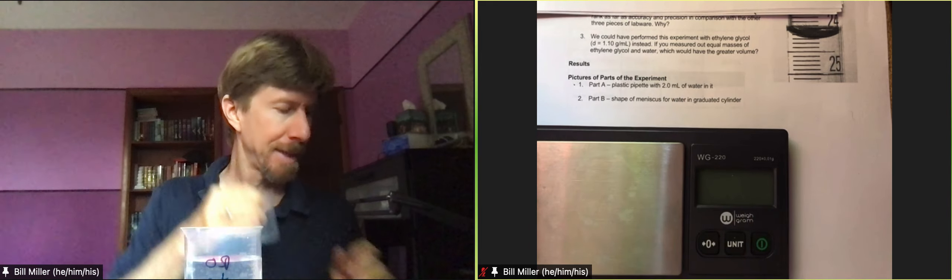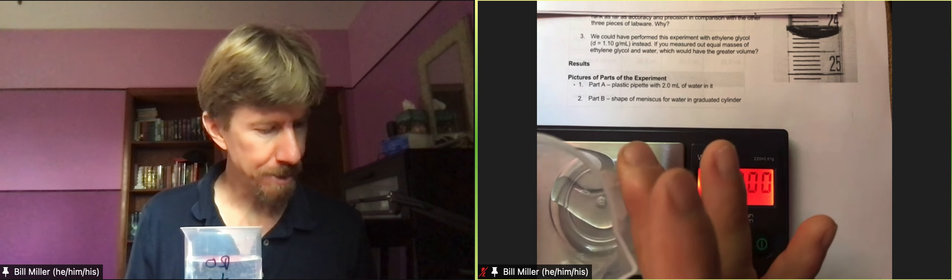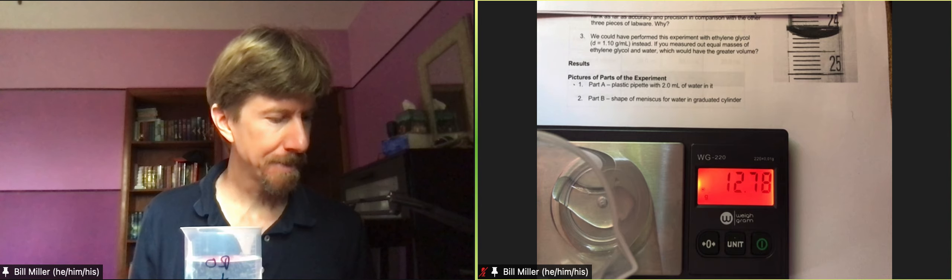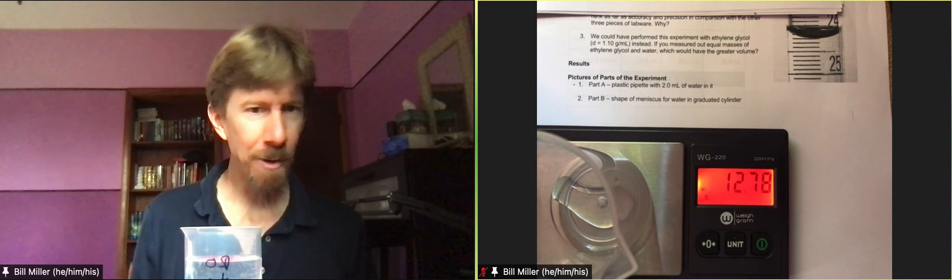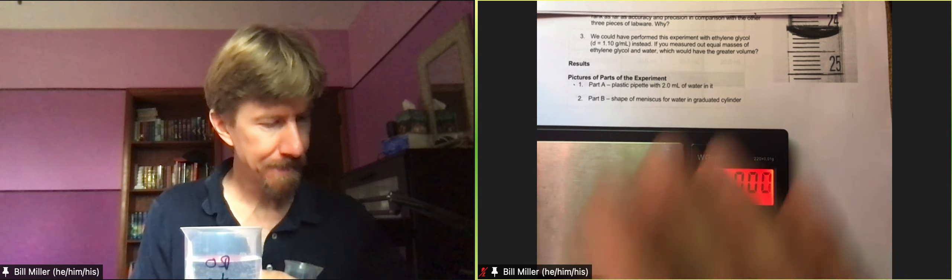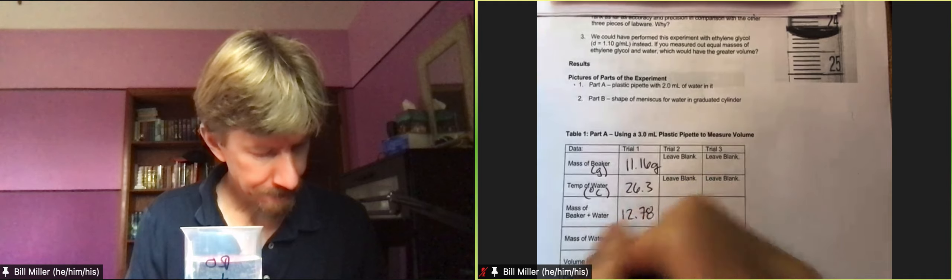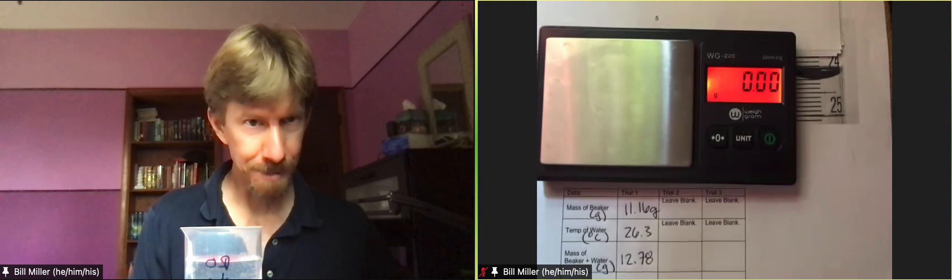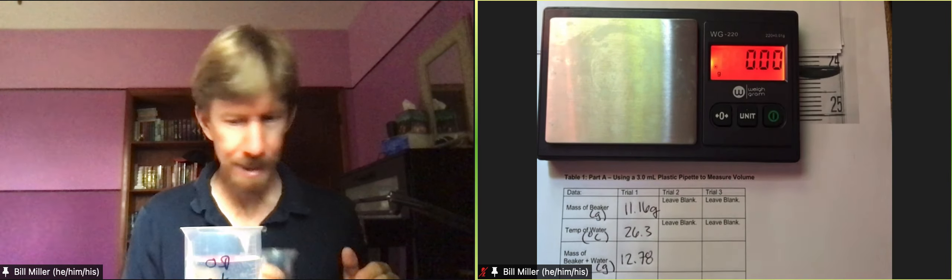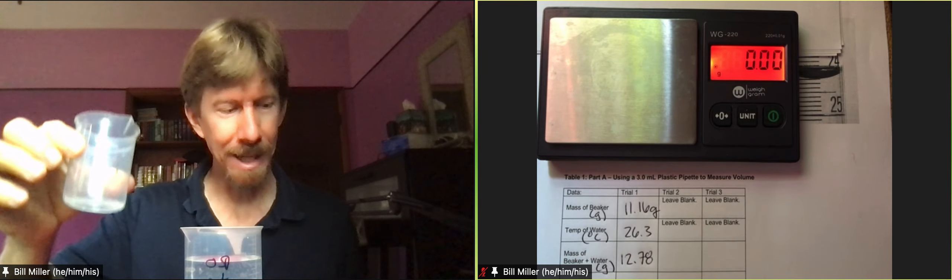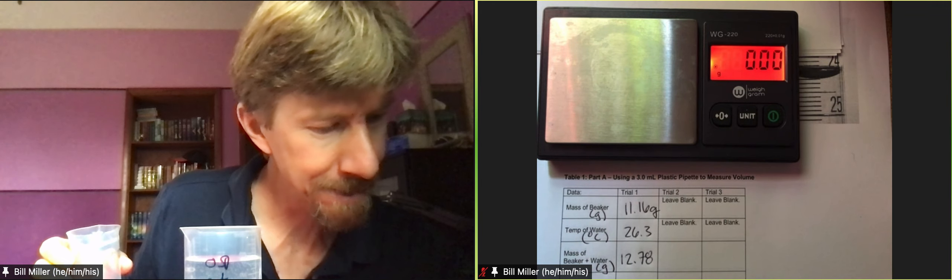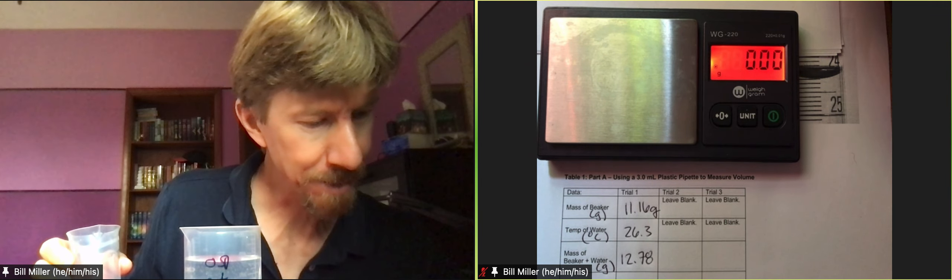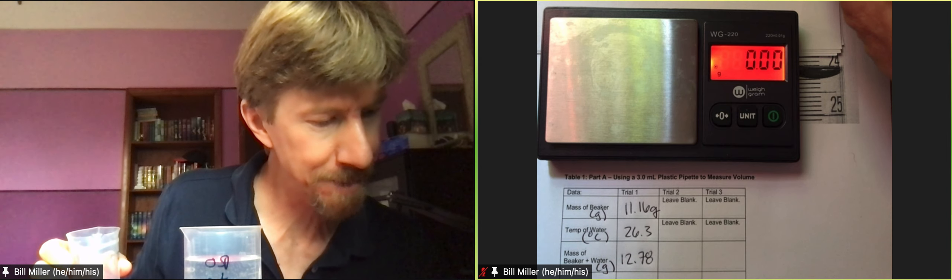Now I'm going to turn my scale back on. I'm going to weigh my solution and now it weighs 12.78 grams. Then I'm going to do it again.